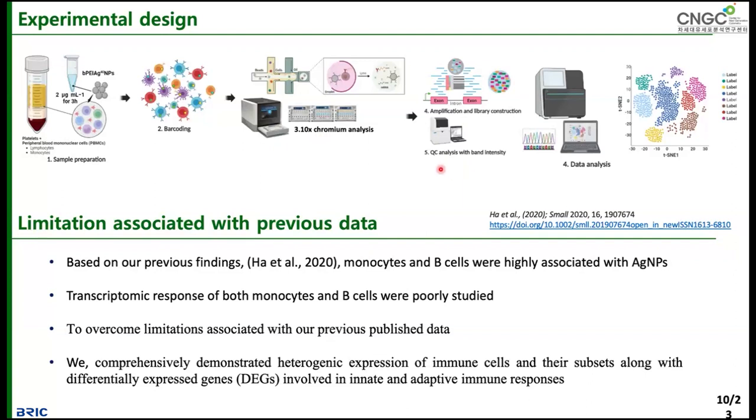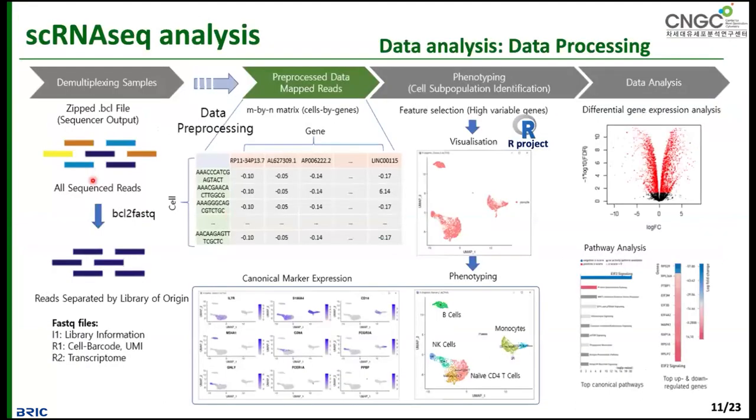We already published another paper in 2020 with this experimental approach, but in that paper we focused only on the monocyte and B cell. In this study, we did it again and performed more detail compared to our previous publication. So we looked at T cell and monocyte and some other cells, how they respond, and we confirmed. And this is what we get as the raw data.